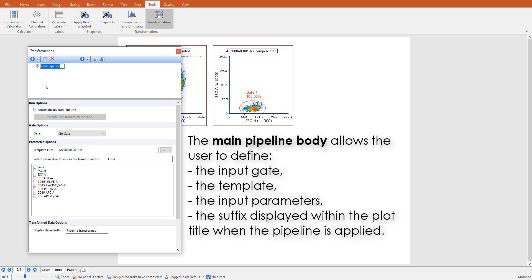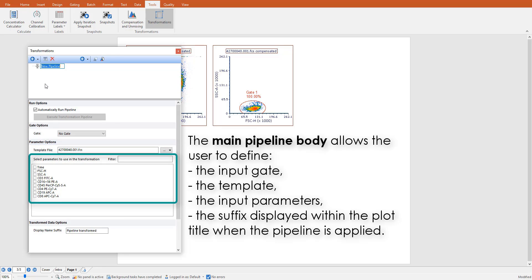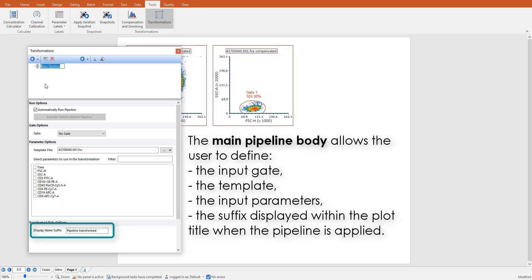The main pipeline body allows the user to define the input gate, the template from which a parameter list is retrieved, which parameters of that list should be used as input for the pipeline, and the suffix that will be displayed in the plot title once the pipeline is applied.